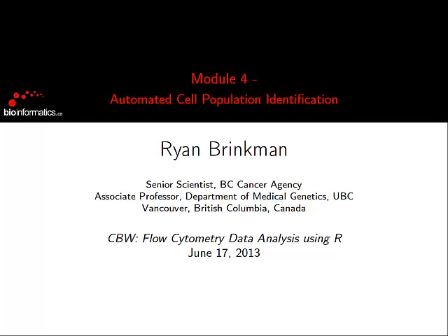Okay, so all that stuff you did yesterday would have sucked even more if we didn't have the opportunity to do automated data analysis in terms of getting rid of that whole gating step. Because a lot of this stuff yesterday was just reading in the files, doing transformation, conversion. That was like getting to first base.